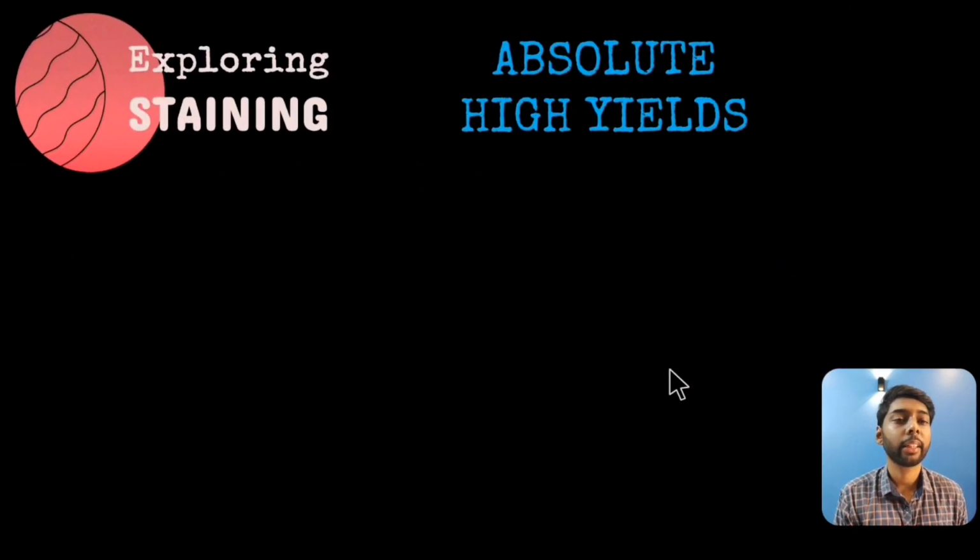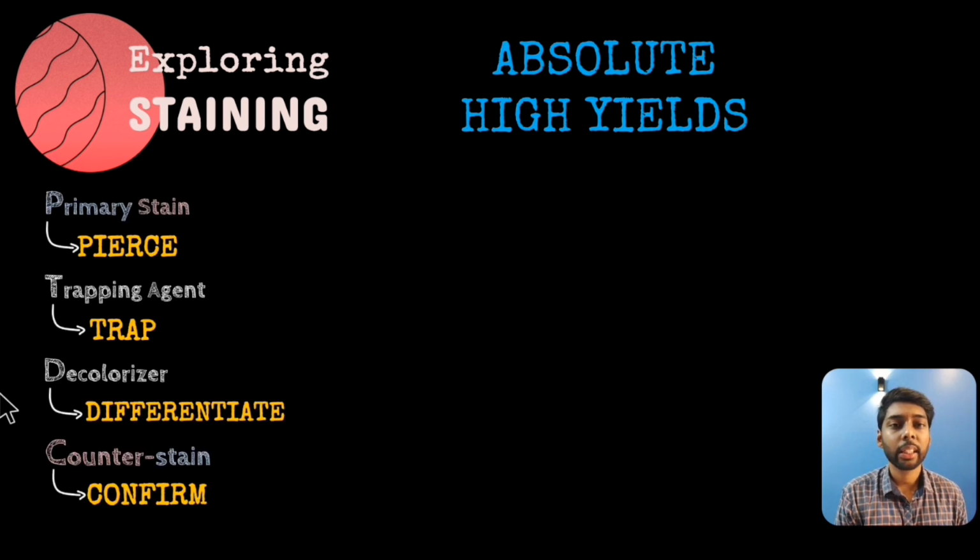So that's mostly it for this video. Now, to give you the absolute high yields, obviously you have to remember these few steps and what they actually do. Most of the time, we recall what primary stain and what trapping agent we use, and we memorize these, but we tend to forget why we use them. So that's why I have created this simple mnemonic type of device for you guys to remember it easily. And also, the most important thing would be to retain it in the long term.